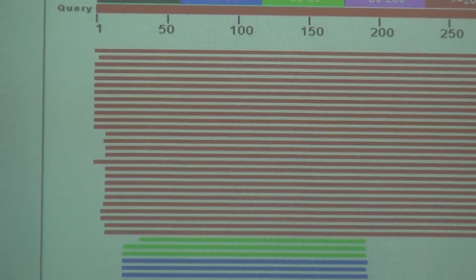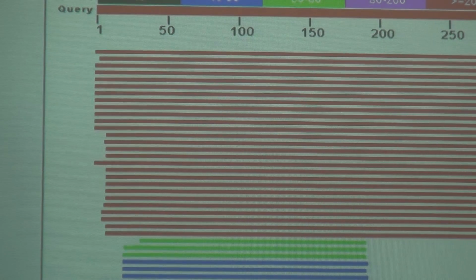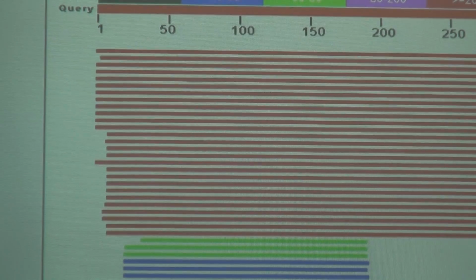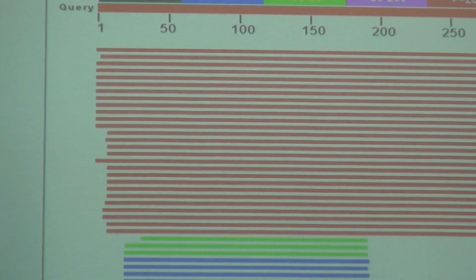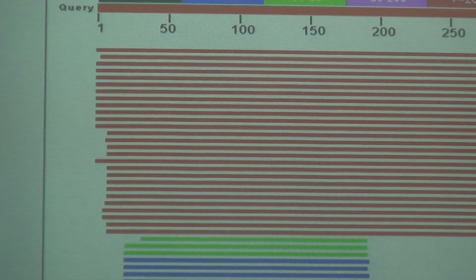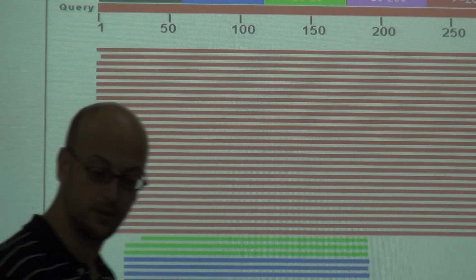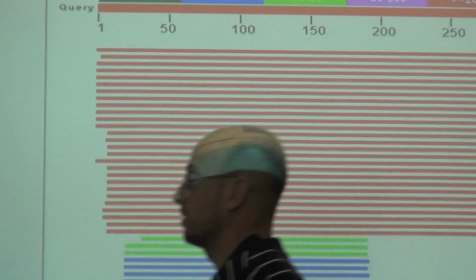And we have here the results in several formats. First of all, we have these pretty colorful lines. What do they mean? These lines are alignments. Remember, we talked about alignments. We said very simply, how do we create the alignments?